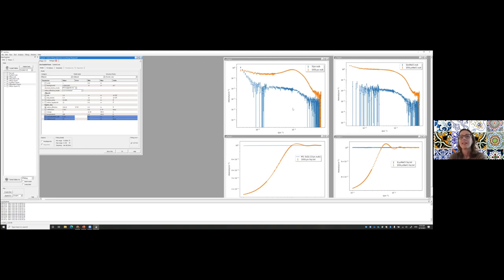But again, in the information that I give you, I tell you that I measure the concentration after preparing the sample, but I don't think I tell you if I measured it before or after the SANS data collection. And because data collection for neutron scattering, unlike SAXS, can take hours easily, it's plenty of time for a protein to precipitate at the bottom, or for larger aggregates to start settling towards the bottom and move out of the beam.